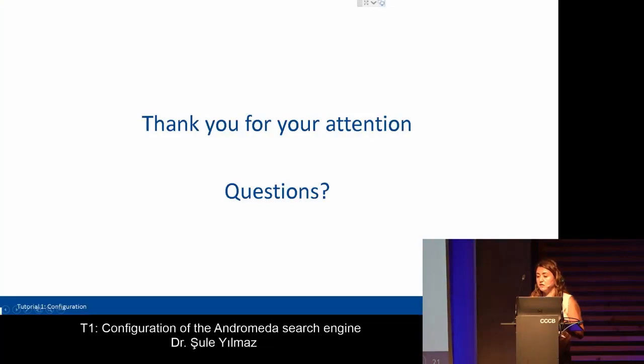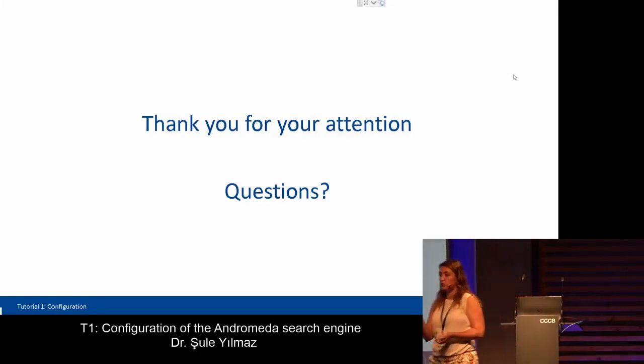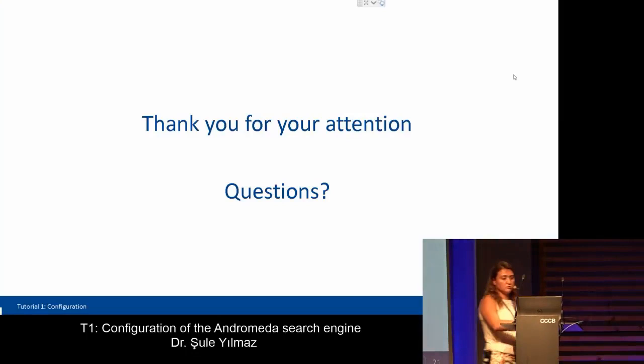But before we end, we need to make sure that you restart MaxQuant to enable what you have done in this configuration, which we will also be repeating. So we could also do it together.